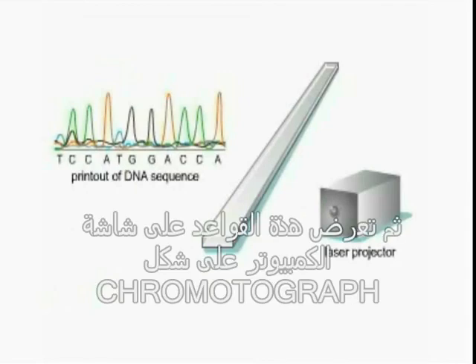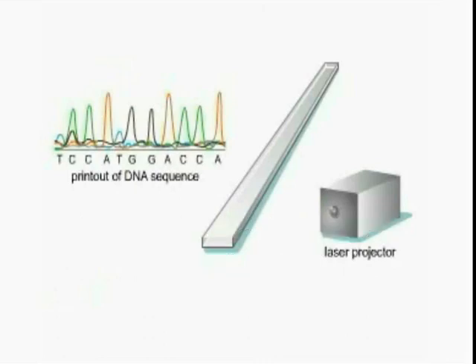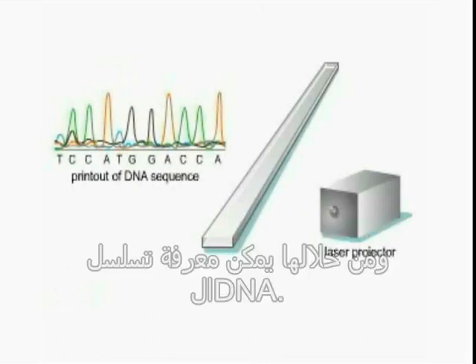Then, the bases are shown on the screen of the computer as a chromatograph, allowing them to know the DNA sequence.